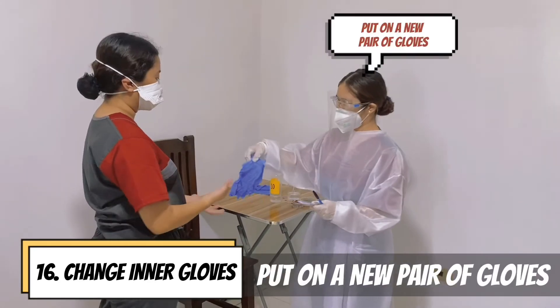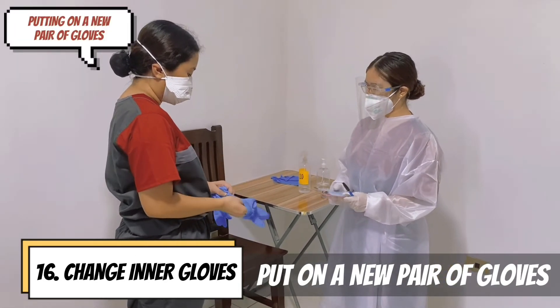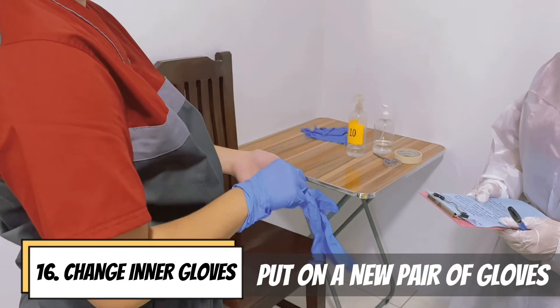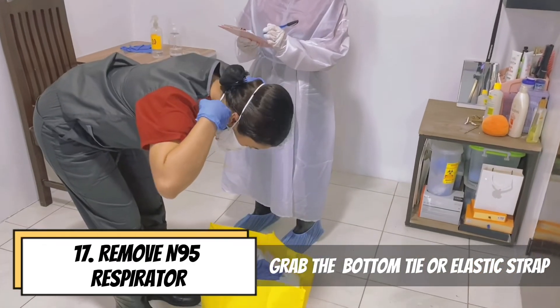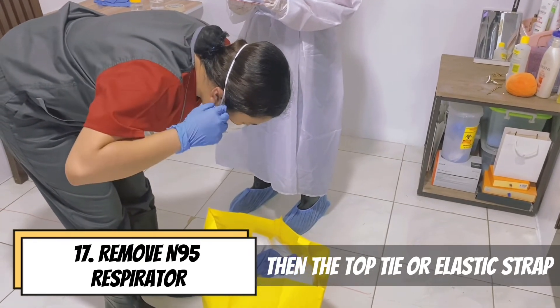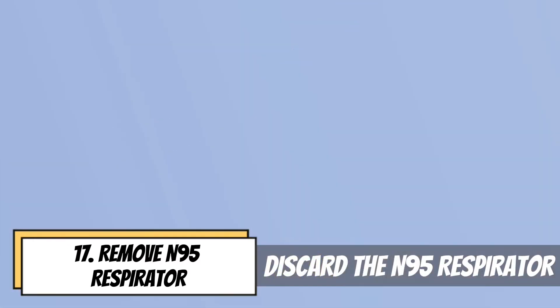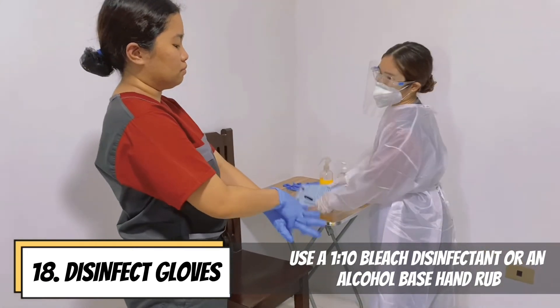Put on a new pair of gloves. Tilt the head slightly forward and grab the bottom tie or elastic strap. Remove without touching the front of the respirator, then discard it. Disinfect the glove using a 1-to-10 bleach disinfectant or alcohol-based hand rub.